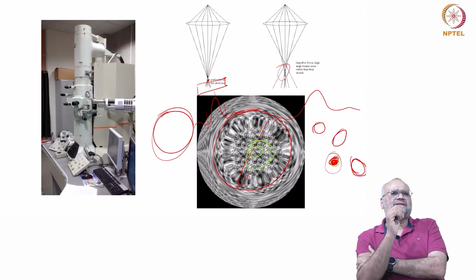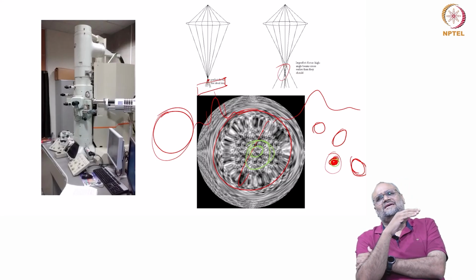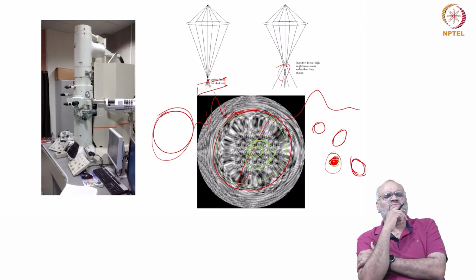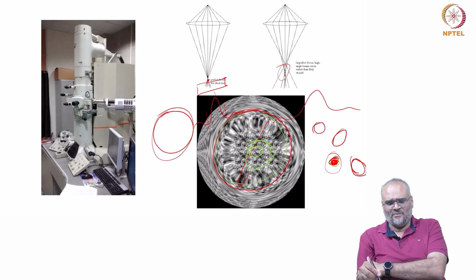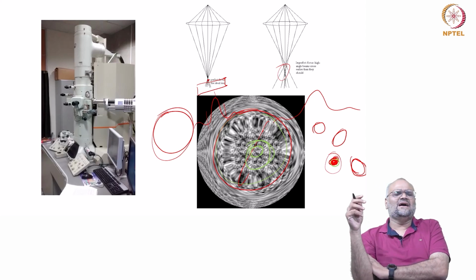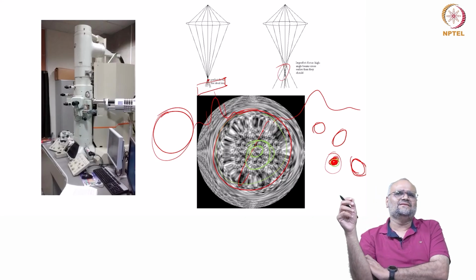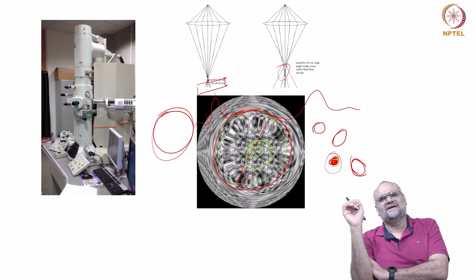This is if I am operating in a microscope which does not have an aberration corrector on the condenser lens. The aberration corrector on the condenser lens is called a probe corrector, and there are some automated algorithms based on which this ronchogram correction is done. You have something called the tableau. You actually apply a tilt, and based on how my projection is changing with the tilt, I can account for this and correct for it, make it as symmetric as possible, and then I get nearly, I wouldn't say aberration free, but optimally aberration corrected images as well.